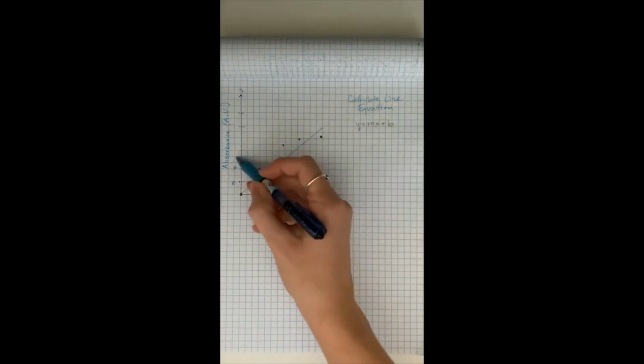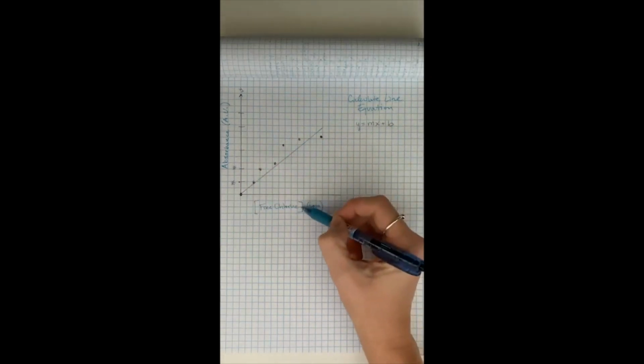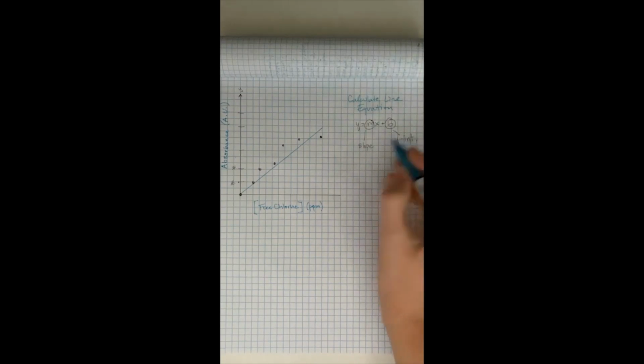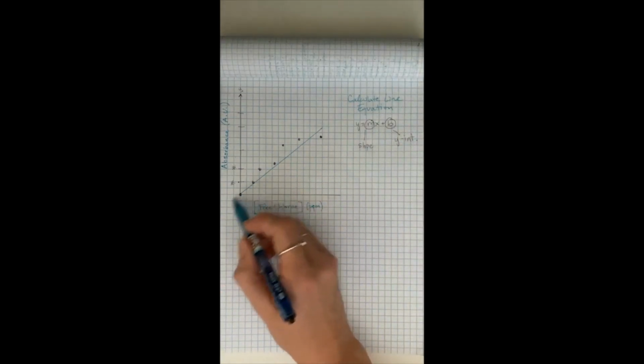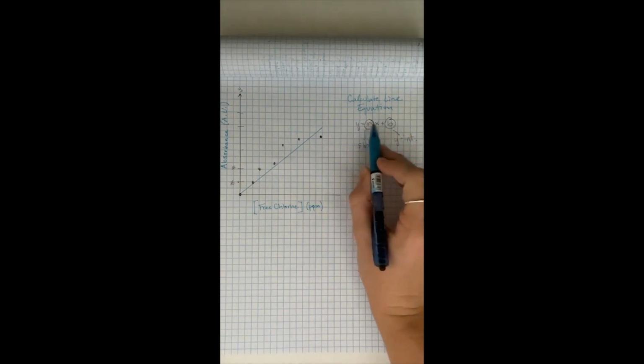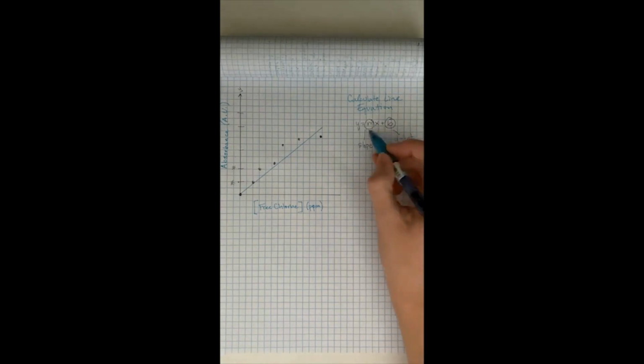The y represents the absorbance, x represents free chlorine. M represents the slope, and b represents the y-intercept, which is where the line crosses the y-axis. We're going to start with m because we need m to solve for b later, which you'll see.